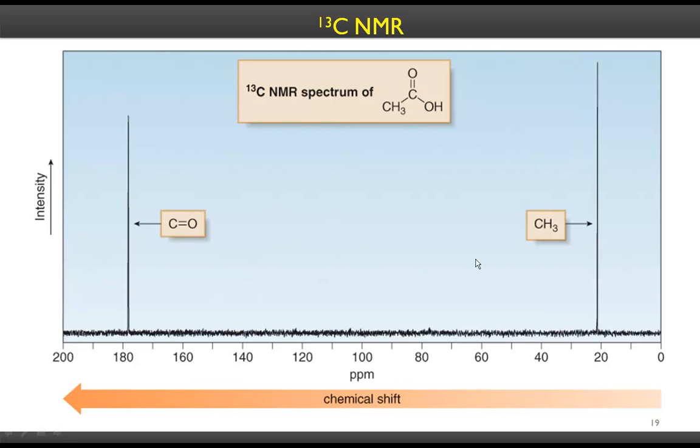So we have 2 peaks here that correspond to 2 carbons. When you are in carbon NMR, just focus on carbons mostly. We'll have some other types of spectra, we'll talk about that. But when you are analyzing the single line spectrum, you focus on the number of types of carbon. You can safely ignore the hydrogens. And when you are in hydrogen NMR, focus on hydrogens. You can ignore the carbons, so to speak. They don't couple with the hydrogen. So you have to learn to shift your focus to the nuclei that you are observing.